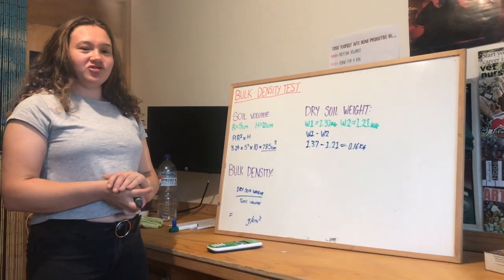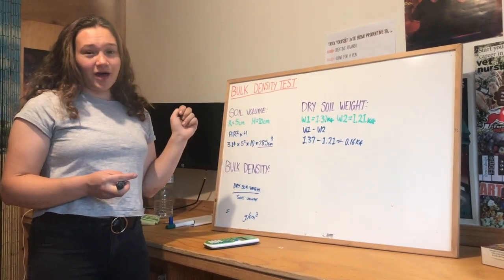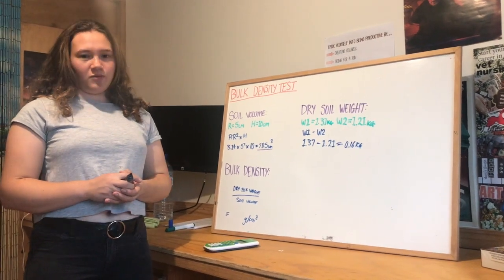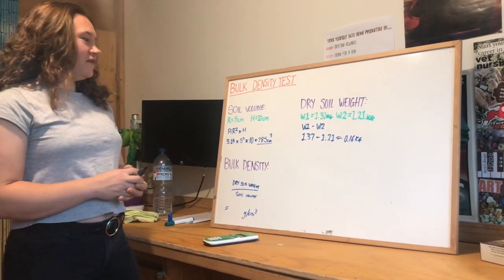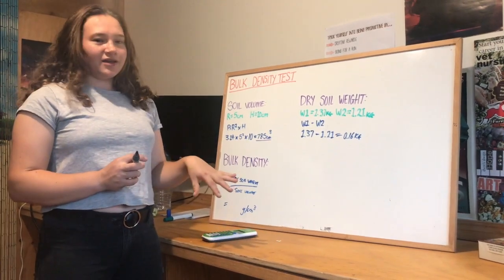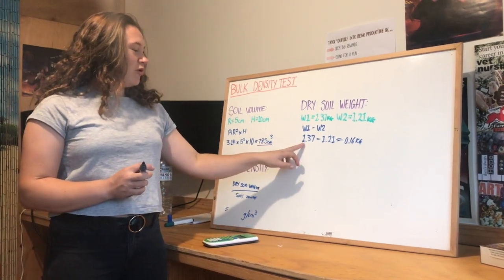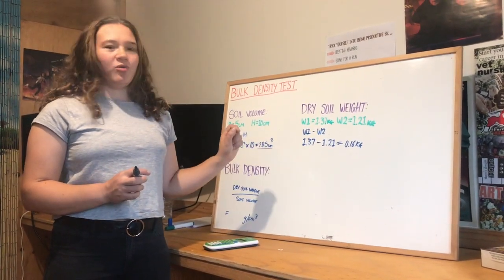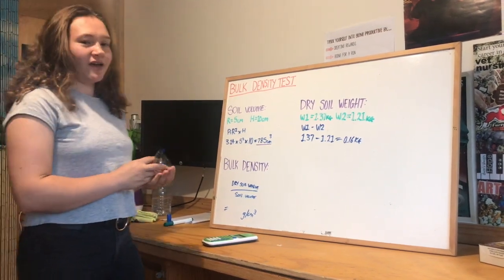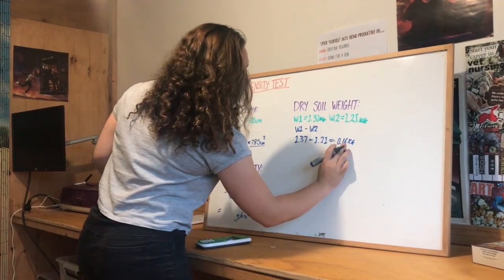Now to calculate our dry soil weight, we have our 2 calculations here. We have our weight from before we put our soil sample in the oven, and we have our weight from after we put our soil sample in the oven. So all we have to do to calculate the weight is subtract the second calculation from the first. In this case, it's 1.37 kilos minus 1.21 kilos, and that gives us a total of 0.16 kilos, or in other words, 160 grams.